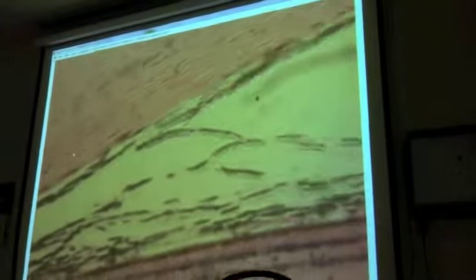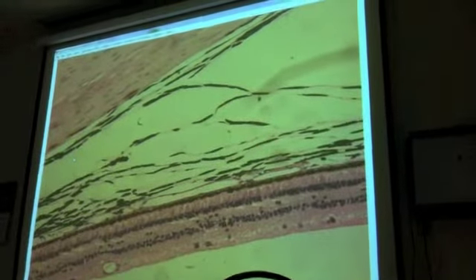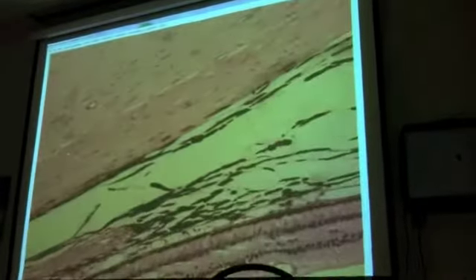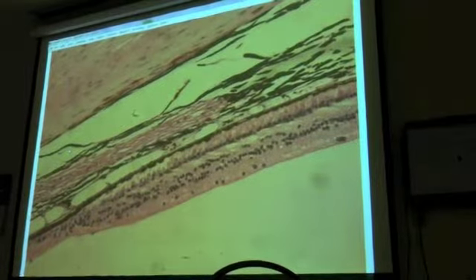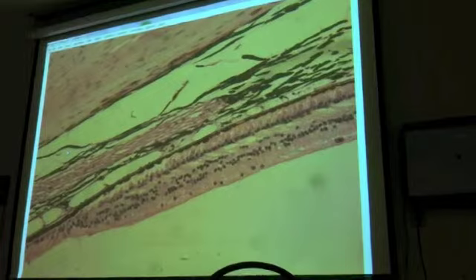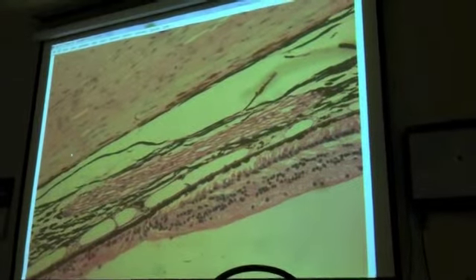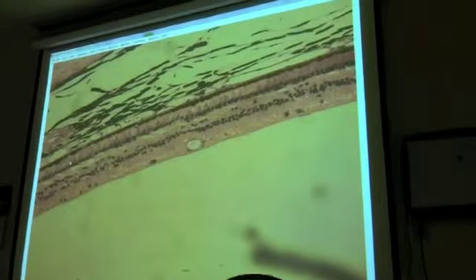All right, so right here, we've got disruption of the choroid layer. Okay, it's separated as an artifact right here. Nonetheless, you can see the retina thins and ends right here. Okay, so we're near the front of the eye. Can you do that part of where the retina ends? I missed it, looking back for it.